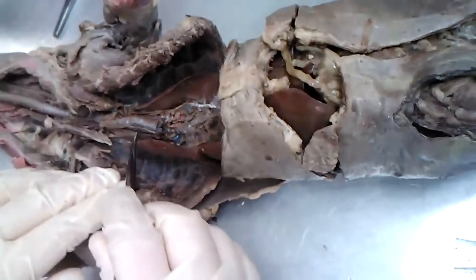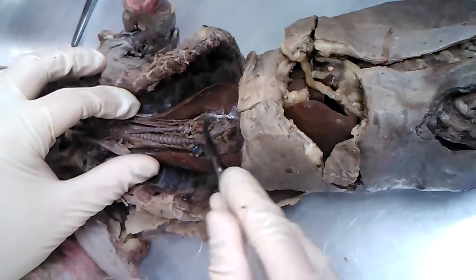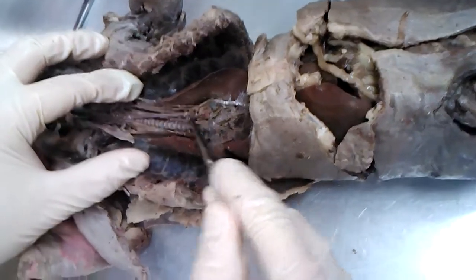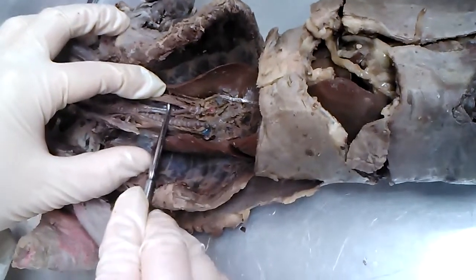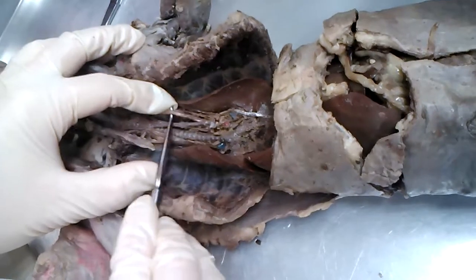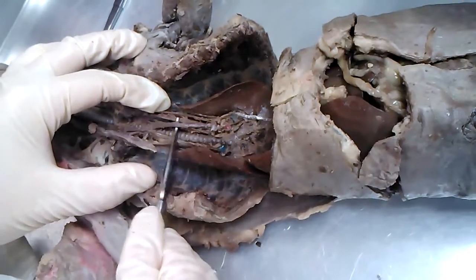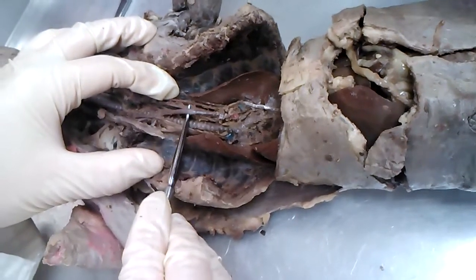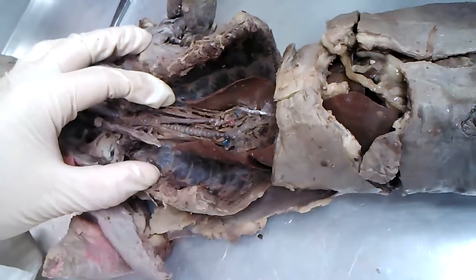Back inside the thoracic cavity, if I can pull this vein out of the way, remember we had our aorta right here that was cut in cross section. Then we had two big arteries branching off the aorta. On the mink's left-hand side, right in here, this was the left subclavian artery. On the right-hand side, this big artery was brachiocephalic trunk. And there are 3 branches that come off the brachiocephalic trunk branching like this, the bird's foot.